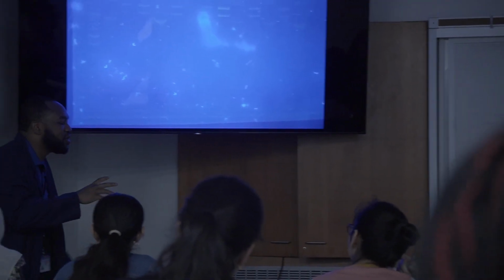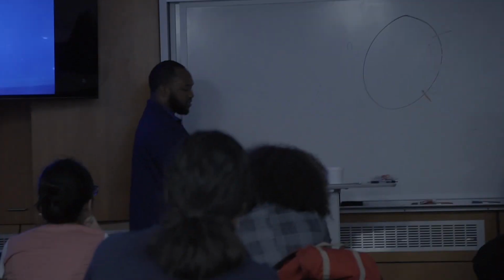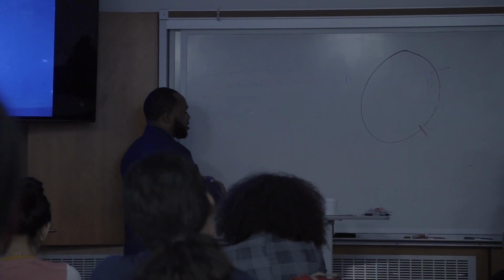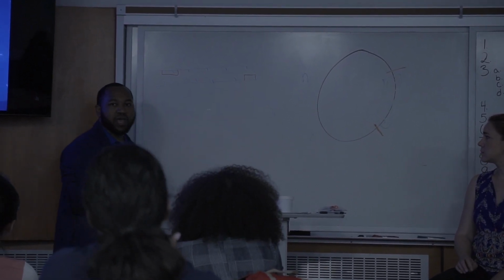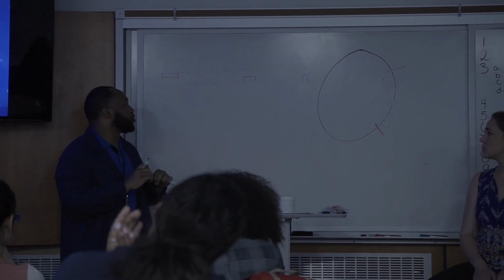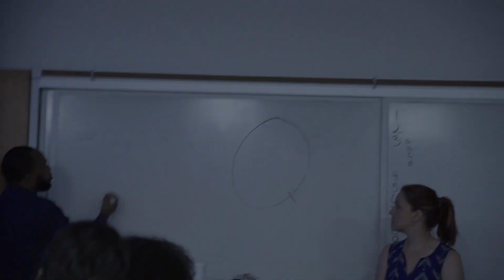For example, I won't go through the math, but let's say you ran 3 cycles. I'm going to show this really quickly. There are some animated videos that might show this a bit better, but let's say this is my DNA, hypothetically. Let's assume it just got separated, and I'm going to add a primer here and here. Now, you'll see in your procedure the elongation step. We had it for 3 minutes, but various enzymes and plasmids work differently, so the timing may or may not need to adjust. But what happens if, by the time the cycle ends, we stop here?